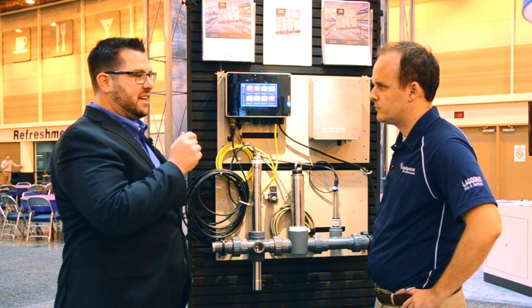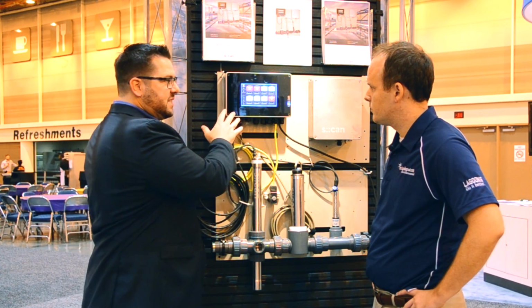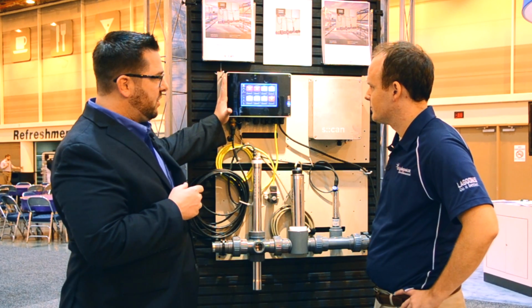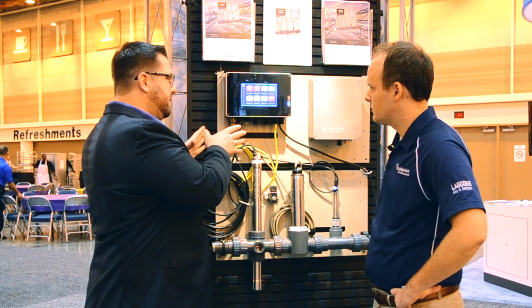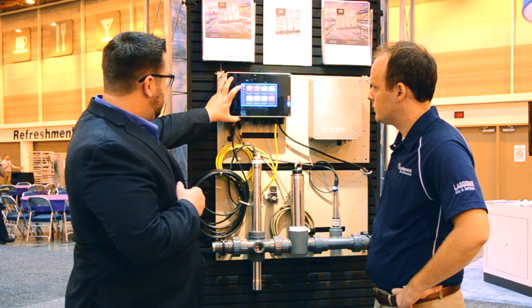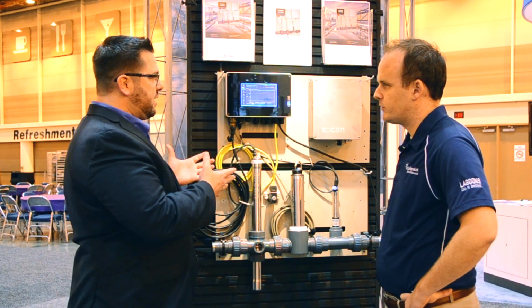What's cool about that is that if you pull up this IP address on your phone, this is exactly what you're going to see. You're going to see exactly this screen. You're going to have all the functionality and all the capabilities as if you're standing right in front of this computer. So you can look at time series data, you can look at alarms, you can calibrate the sensor, you can do everything as if you're standing right here.